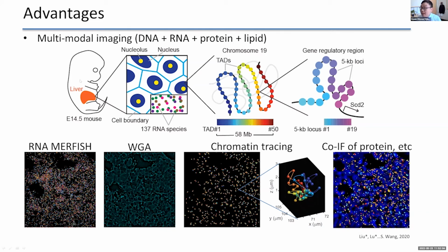So let's say you are writing an R01 grant, and in the section where you want to talk about why your proposal is technologically and conceptually innovative, maybe based on the context of your scientific question, you can talk about not only the benefit of having a single-cell transcriptome profile together with the spatial information, but also the fact that multiplex FISH has high detection efficiency, high spatial resolution, 2 levels of RNA spatial information, and this multimodal capacity in that section, right?